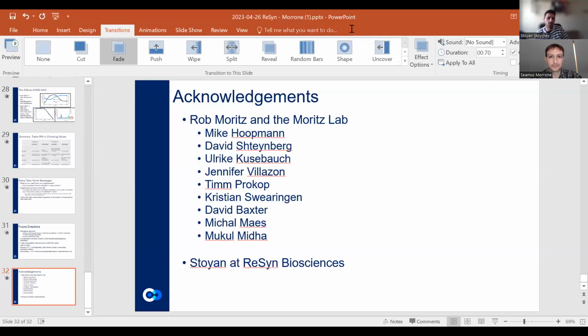Thank you, Seamus. Thanks for the informative talk. I think it's always great to see the balance between all these different parameters to get the optimal identification rates. And I suppose maybe the first question I wanted to put to you is, what about quantification? Is there a balance there? If you want to also apply some kind of quantification in the DDA, probably on precursor level, how does that look in terms of the various parameters you've tested?